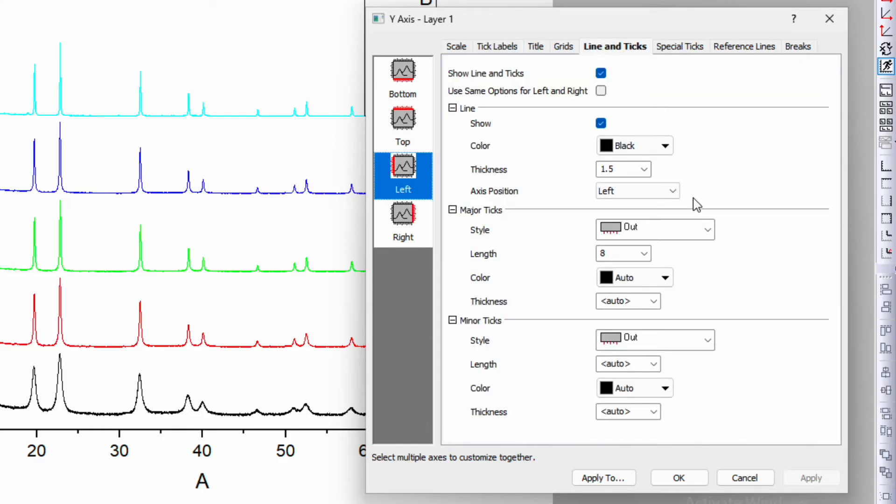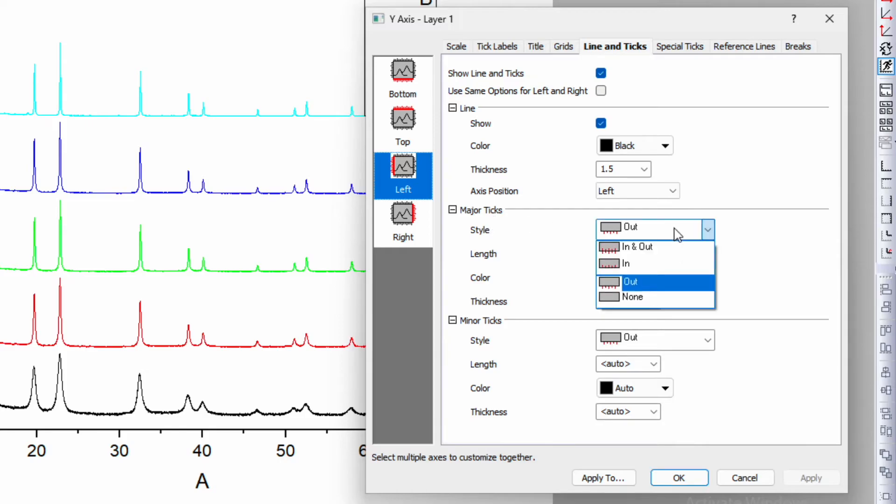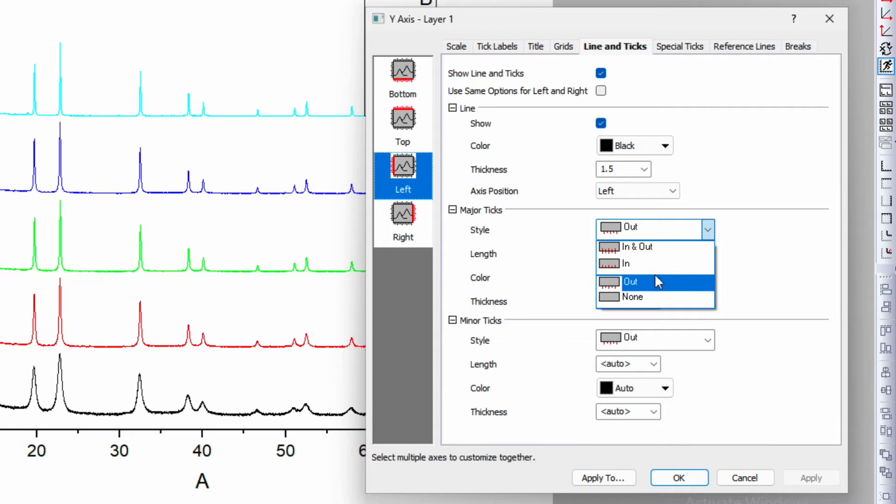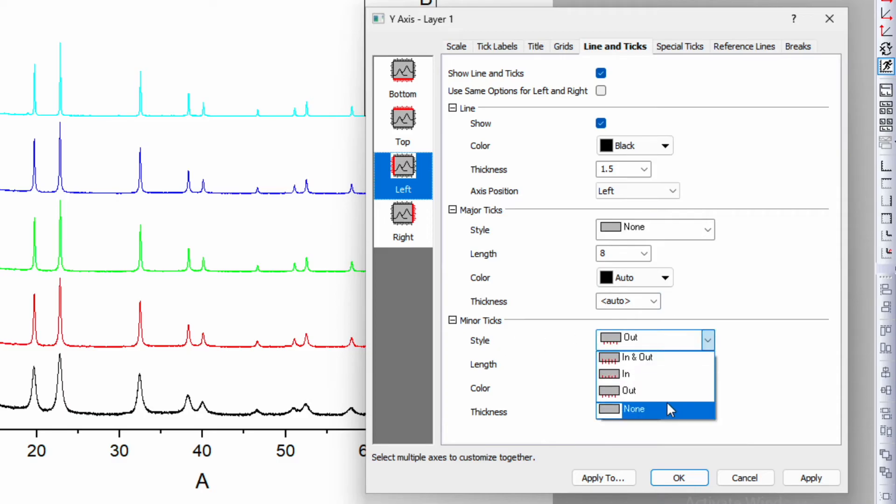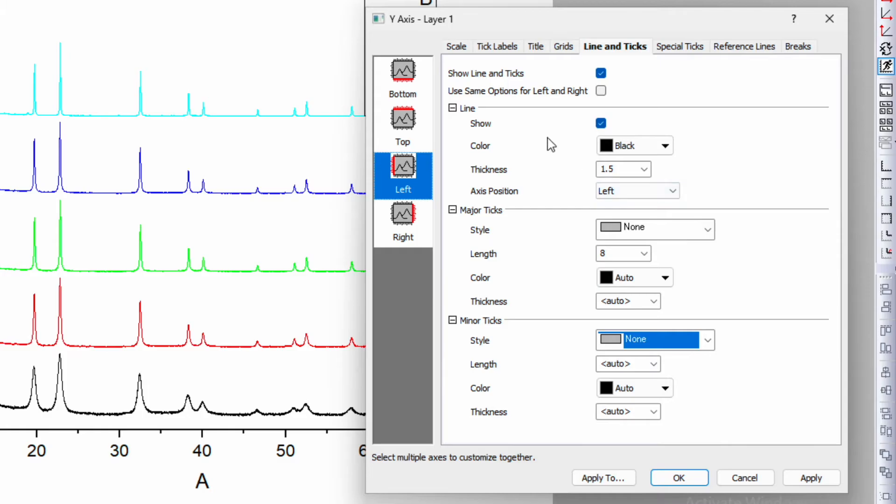Go to the fourth option - line and ticks. I want to use major ticks. There are four different ways to show them: in and out, in, out, or none. Select none. Do the same for minor ticks - select none.